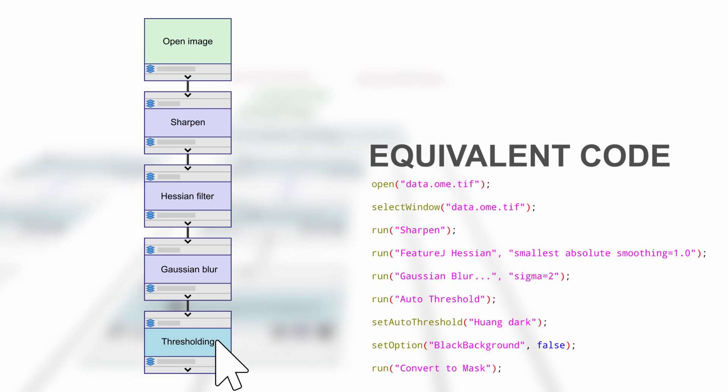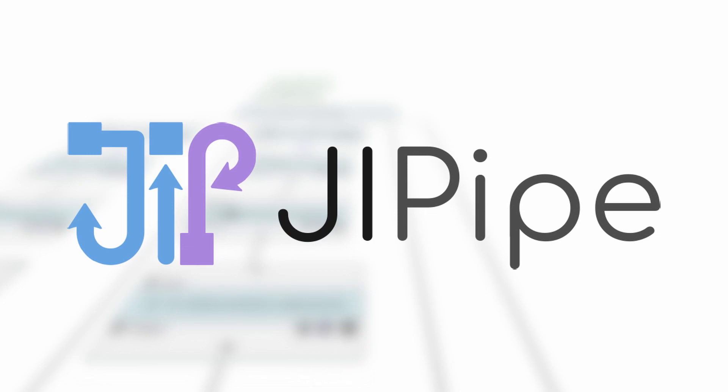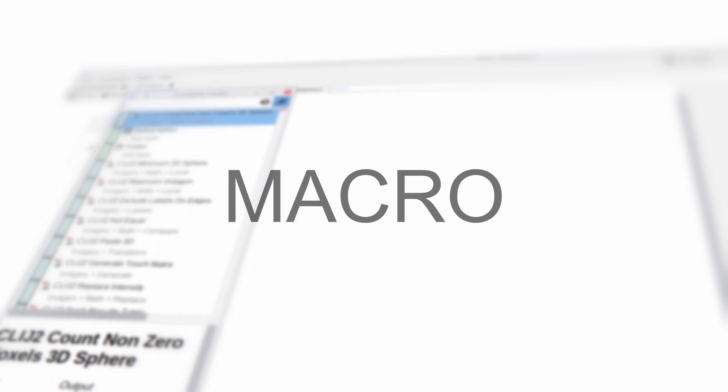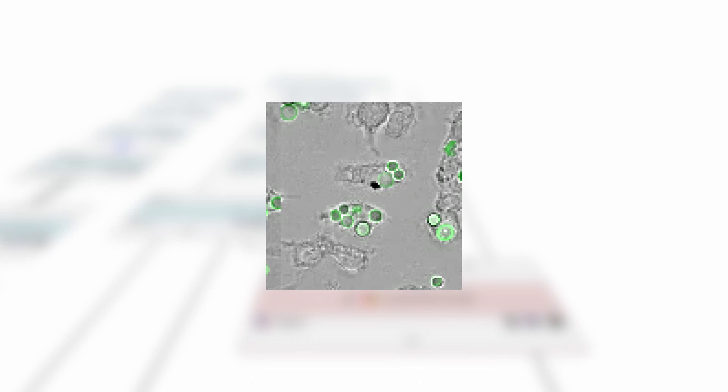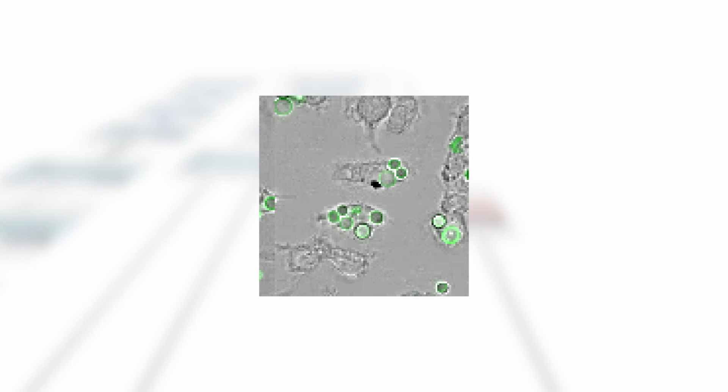Jipipe provides such a user-friendly visual language designed for ImageJ. Our example that we show here will go through the analysis of a typical biological experiment where imaging is used to track the interaction of macrophages and fungal spores.